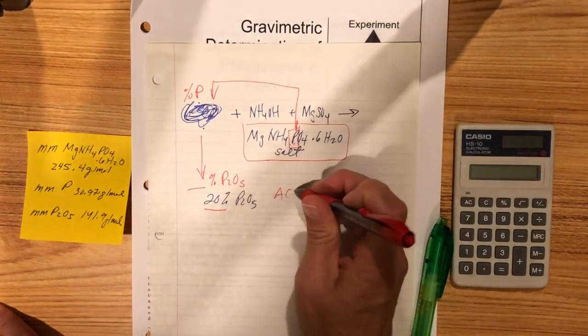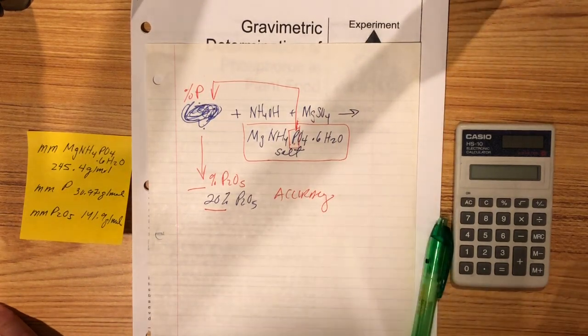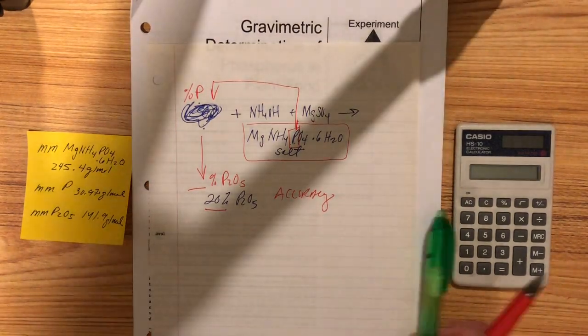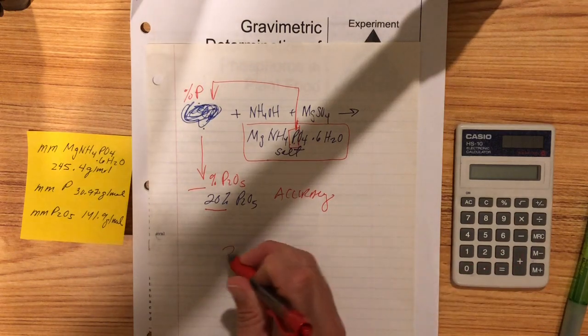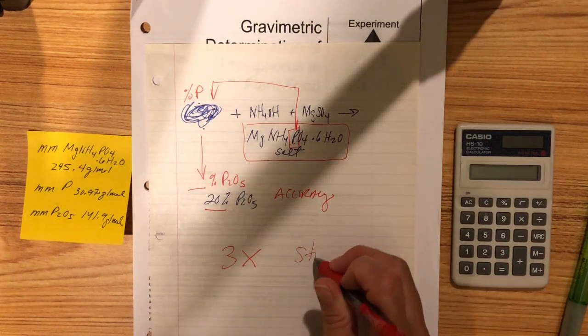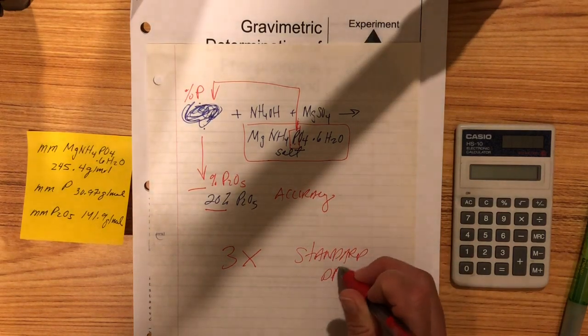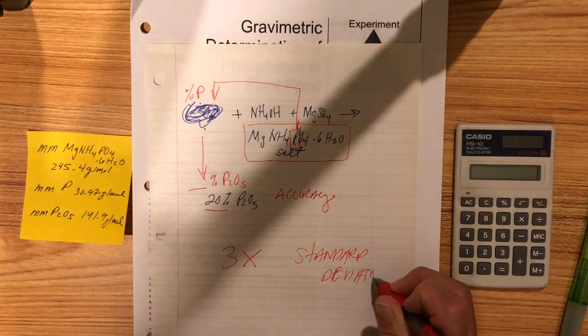And remember, this is comparing for accuracy. We're also going to do a comparison of how precise all of our measurements are, because remember, you did this 3 times over. And we're going to do something called standard deviation in order to tell us how close our results were to each other.